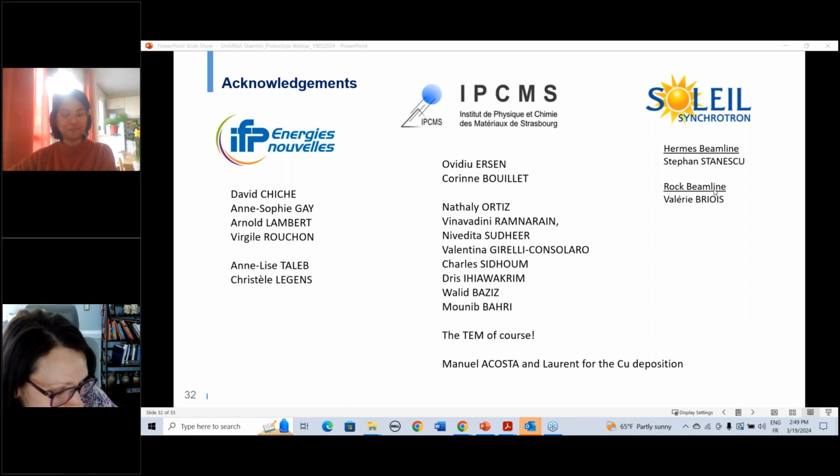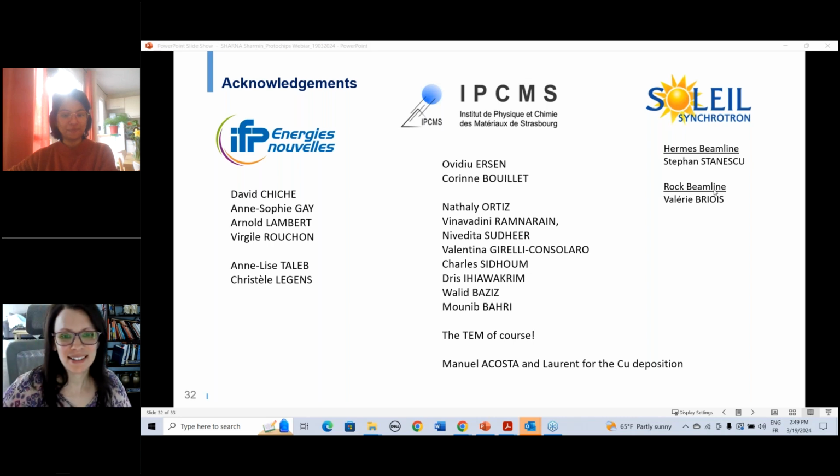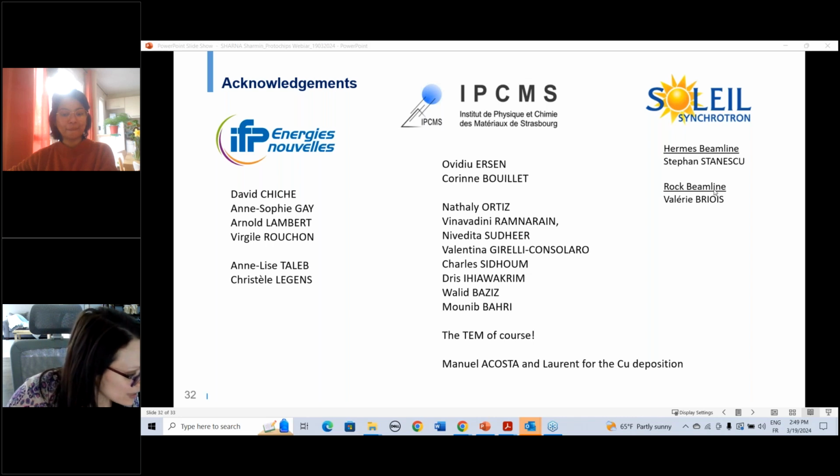It's so important. The more that we can help the community understand that aspect, I think the better for everybody. So that's great. Thank you so much. There's a couple more questions here. Let's see. Do you feel like the amount of oxygen in your reaction could tune your Kirkendall effect, and maybe therefore the final copper nanoparticle size?